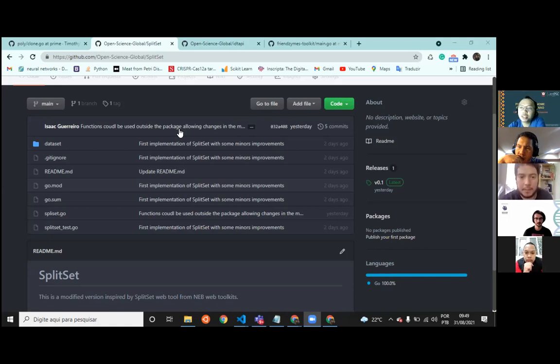The ligation process, does it ligate a single sequence at a time, or does it allow for the ligation of multiple sequences simultaneously? You could make it simultaneously, but the problem is that you could only do this inside one small flask. Because if you do all the mutations in only one flask, you don't know exactly what's ligated to what. So this could be a problem. So we could try to make each ligation separately.